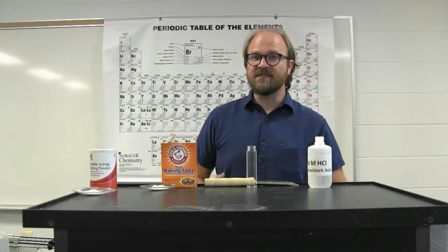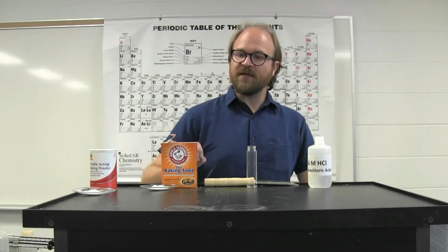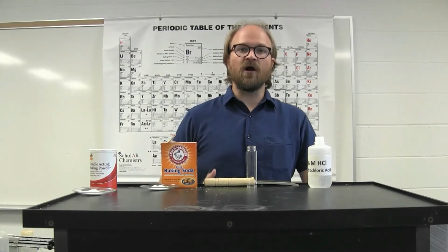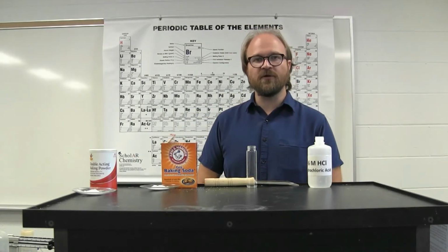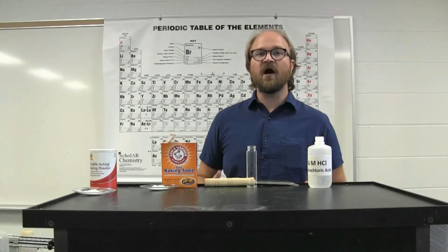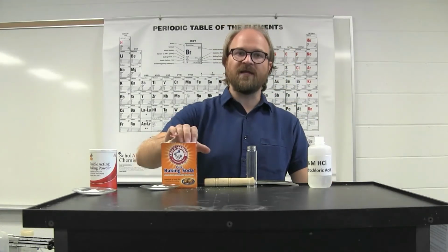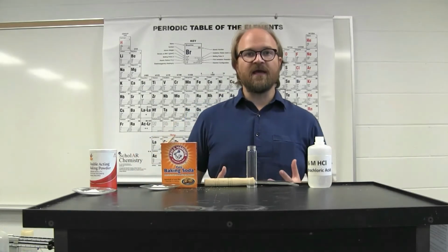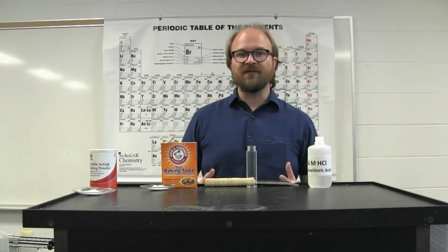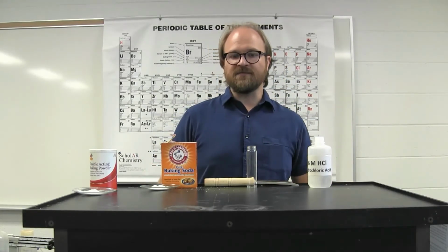The experiment itself looks at the percent composition, in particular, the percent carbonate. All of the components and all of the compounds that you're looking at are different carbonate compounds, one of which is sodium bicarbonate or baking soda. Carbonate is an anion and cannot be directly measured just by weight or in labs like this.